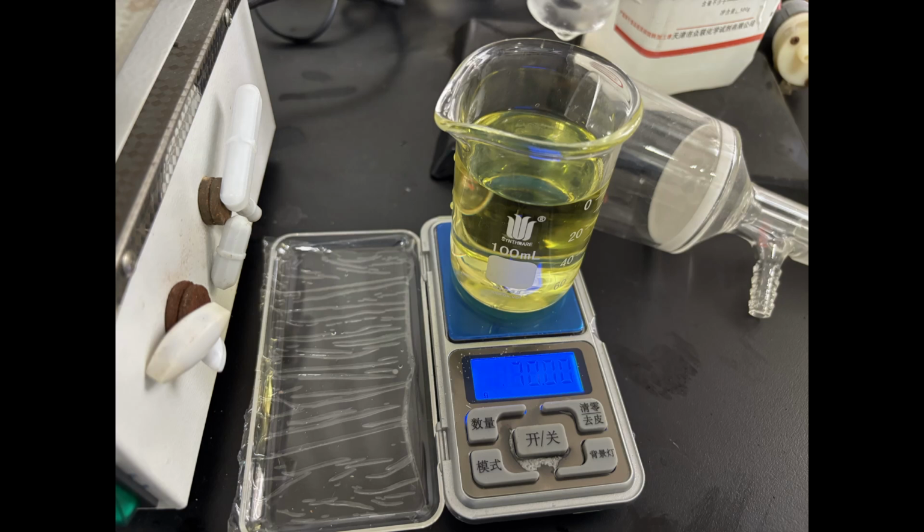The separation was complete, and the N-butyl nitrite is drained in a beaker. Its mass of 70 grams represents a 105% yield, suggesting the presence of impurities, but it can be directly fed to the next step without further purification, such as distillation.